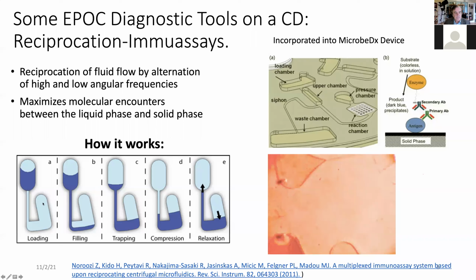Look, say I'm loading this liquid here, right? And I want the liquid to go back up. So first, the liquid is loaded. I'm now starting to spin. The liquid goes down, right? Centrifugal force goes this way. And I keep on spinning. I bring even more liquid in here, so the RPM increases.